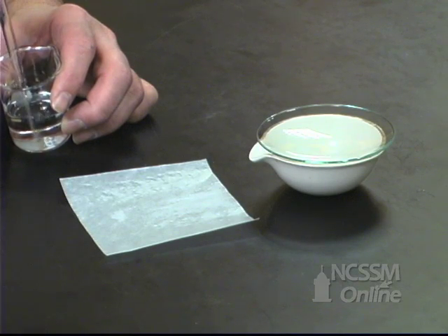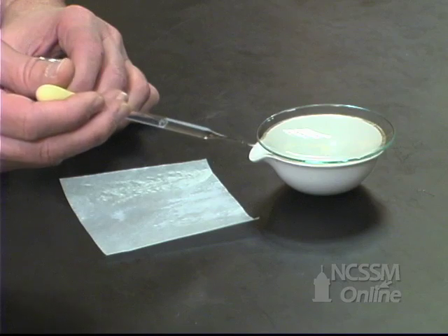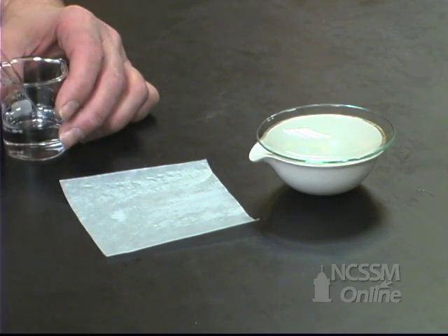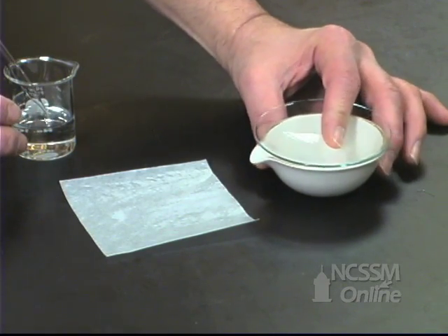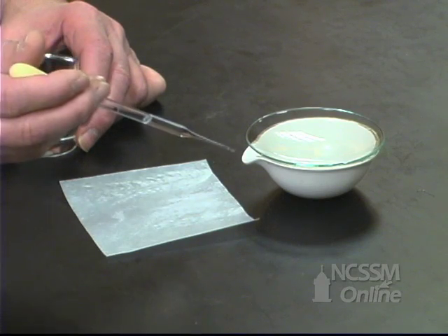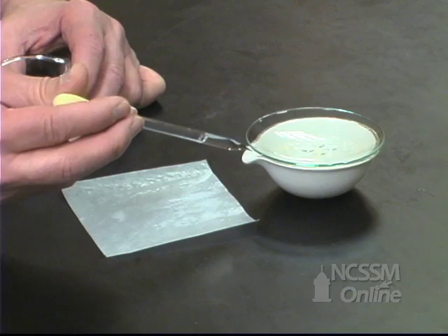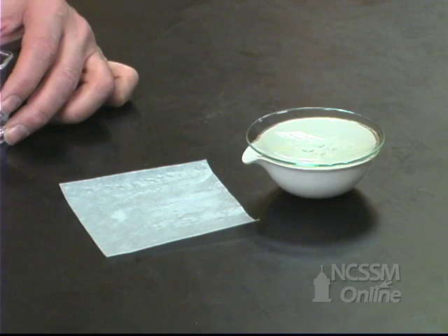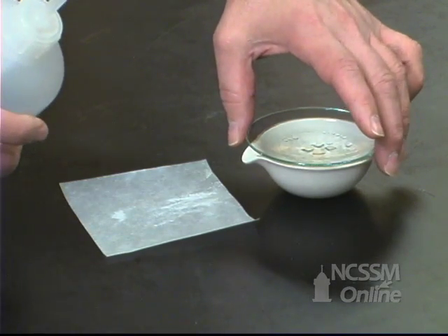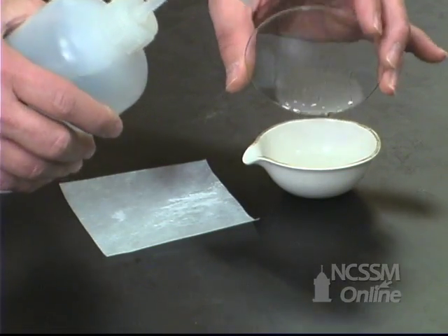We'll continue to add the hydrochloric acid until all the compound has reacted. We'll know this by the fact that we will no longer see carbon dioxide being emitted. We'll gently swirl the mixture to make sure that all the compound has a chance to react. After it appears that all the compound has reacted, we'll rinse the bottom of the watch glass to make sure that any compound that may have splattered onto it has a chance to react.